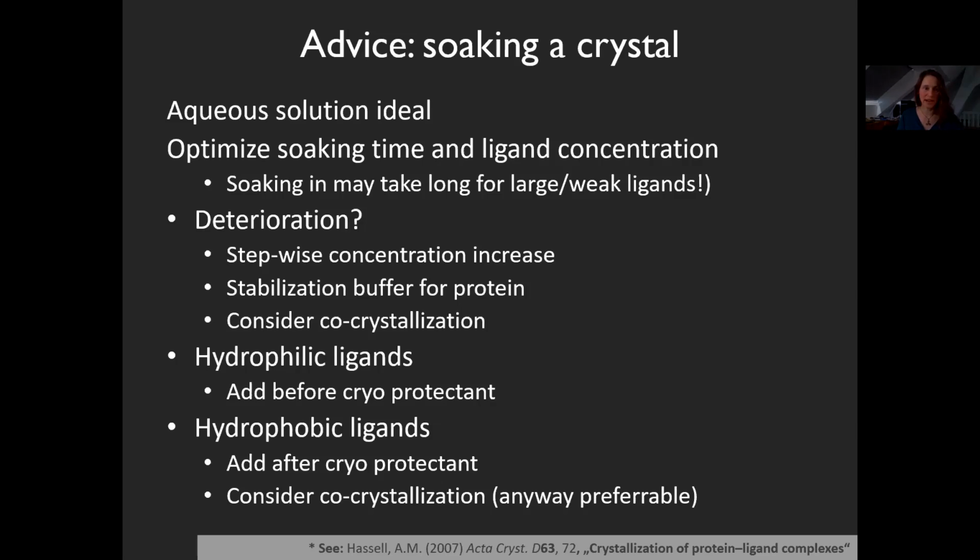Aqueous solutions are ideal, of the ligand, of course. Optimize soaking time and ligand concentration. Soaking may take long for weak or large ligands, as I just said. The protein crystal can deteriorate. If that is the case, do a stepwise concentration increase. So just have drops and put the crystal through the drops, or add ligand solution mixed with buffer to the drop. Stabilization buffer for the protein can help. Also consider co-crystallization, which is generally, I would say, better if you can do it.